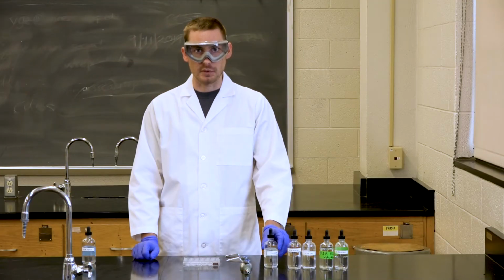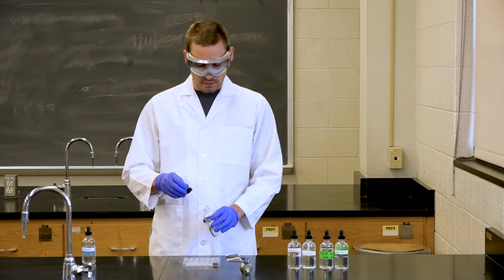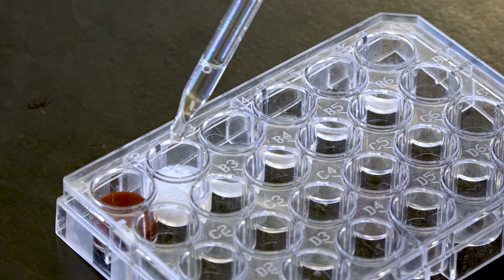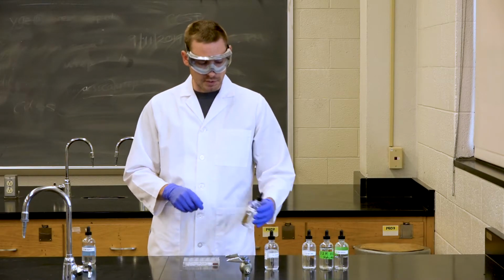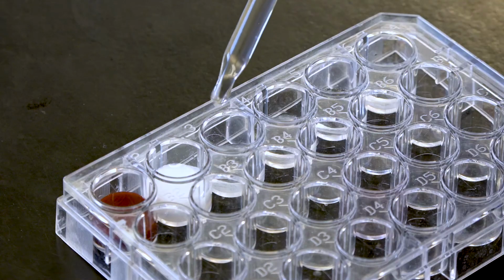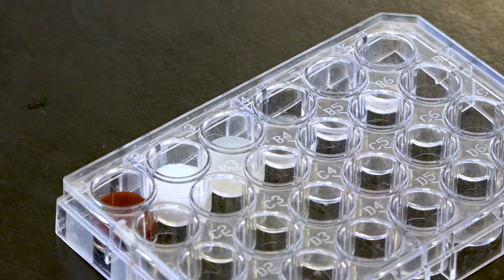The next reagent that we will add is potassium thiocyanate. Add a couple of drops to well 2, and as we can see, a white precipitate forms. Next, we will add ammonium hydroxide to the third well. Again, we have a white, yellowish precipitate that forms.